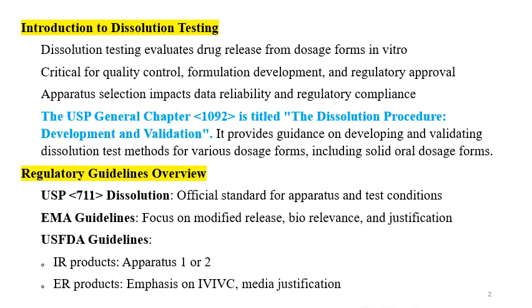It provides guidance on developing and validating dissolution test methods for different formulations or dosage forms, including the oral solid formulations. There are regulatory guidelines like USP chapter 711. For dissolution, it provides official standards for apparatus and the test conditions. EMA guidelines provide information related to modified release formulations, biorelevance, and their justification. US FDA guidelines are there for dissolution testing of the oral formulations.